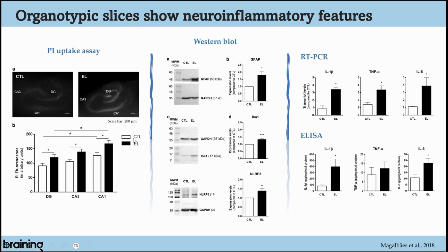Those are the ones that depict the evolving epileptic-like events. And we compare them with slices that were always kept in the presence of 25% horse serum. When we took those slices to the setup, and I didn't show you, but the results are published, we saw that they simply have physiological spontaneous activity, not the activity that you just saw in the previous slide that these epileptic-like slices have.